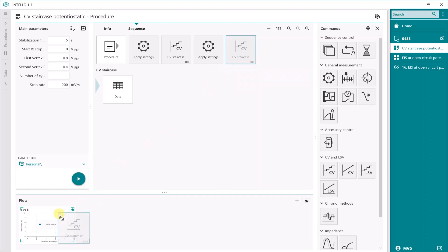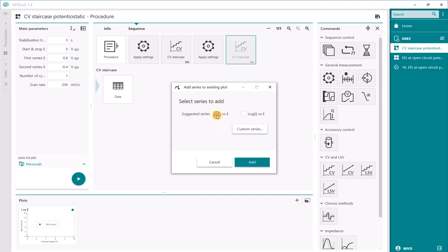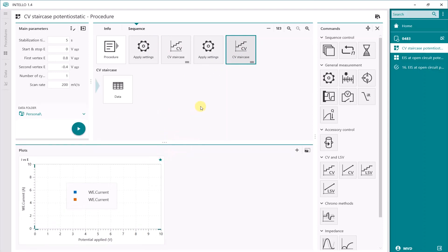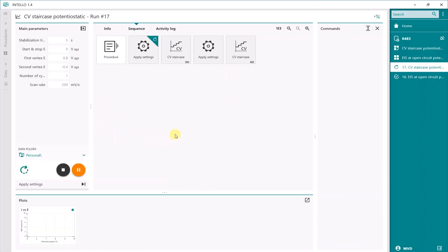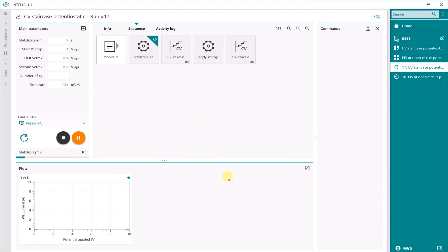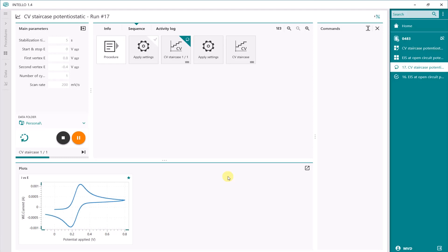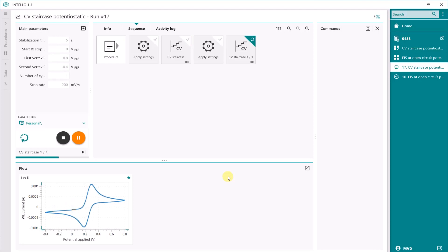I want to show both in the same plot, so I drag and drop my CV command into the graph. I have two types of graphs: the blue one is my compensated graph and the red one is my uncompensated graph. Now everything is set. When I press start, the measurement runs. The blue line shows the result with IR compensation — nice peak separation and nice peaks. The red one is without IR compensation. I can already see a clear difference between the peak separations in these graphs.